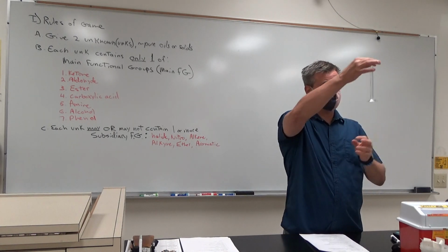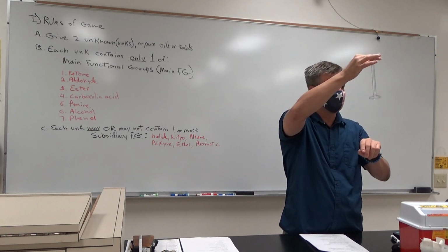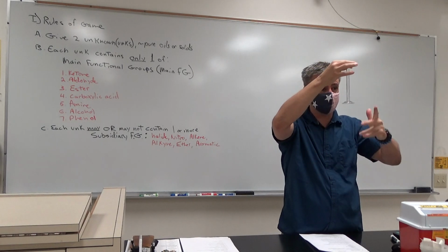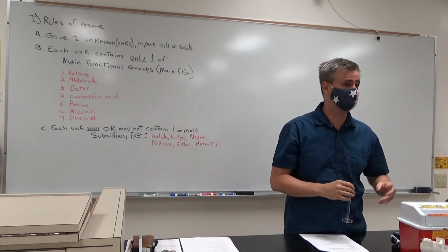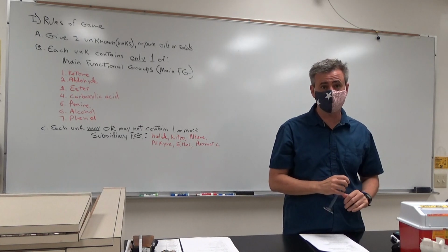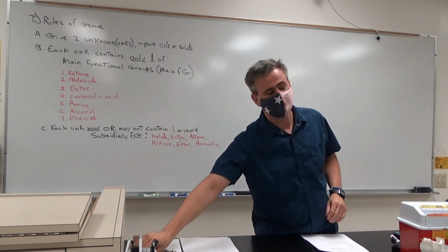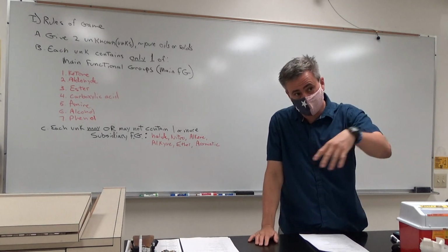A nice thing you can do is hold the test tube at the top and give it a little flick. If you get a lava lamp effect, with little oil droplets, like Italian dressing, going down into the water, that's real oil. That's not an optical illusion like a meniscus. Make sense?